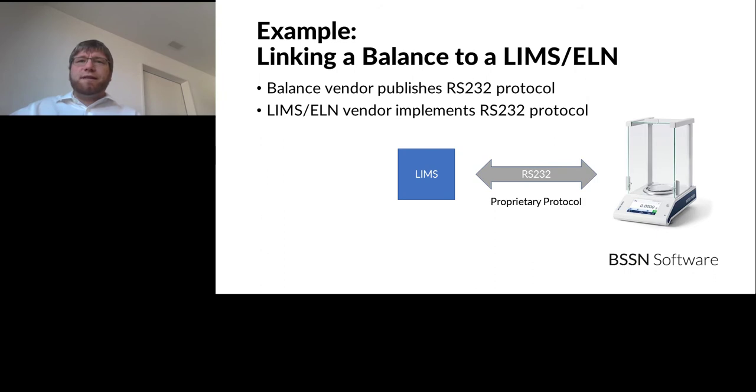So here is an example of another type of integration. In this case, we have a balance that we are connecting to a LIMS. It could be an ELN, could be other systems. I'm using the LIMS as an example here. So in a proprietary world, which is the world of today, the balance vendor will publish, hopefully, a proprietary protocol that then the LIMS vendor can pick up and implement and write a driver for it. And then the driver will speak that proprietary protocol that the balance understands, and they can go back and forth, and then that works. Then the LIMS is connected to the balance. But for the next device, the LIMS company will have to write yet another driver.